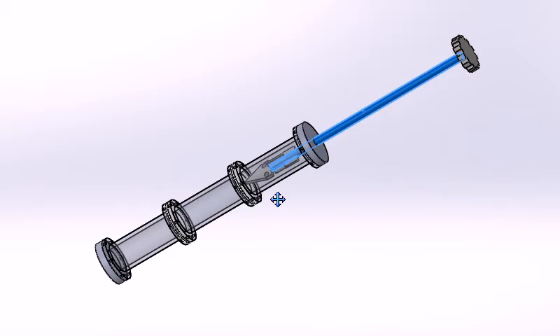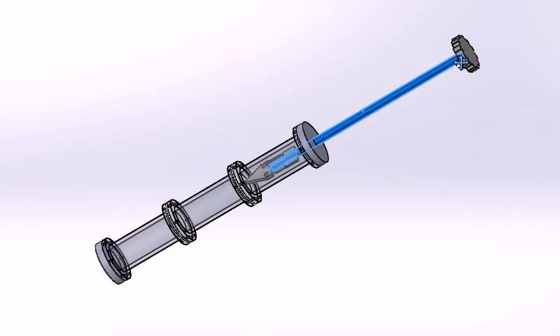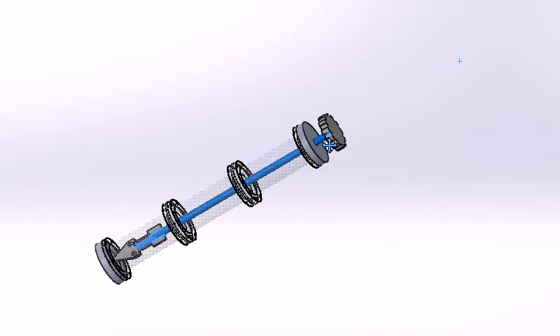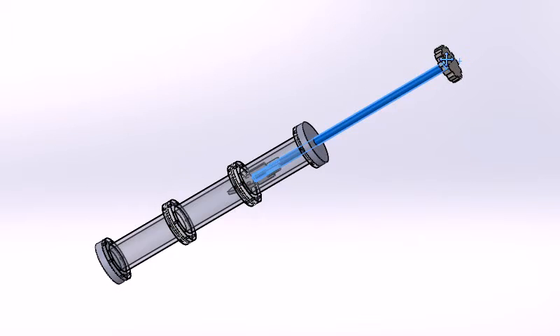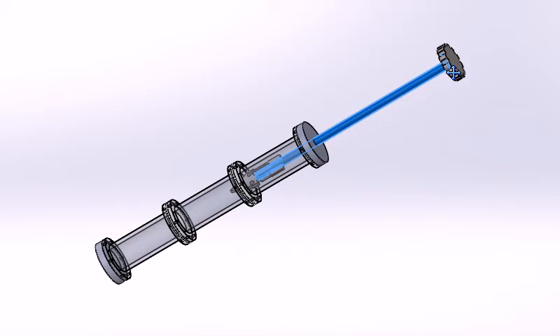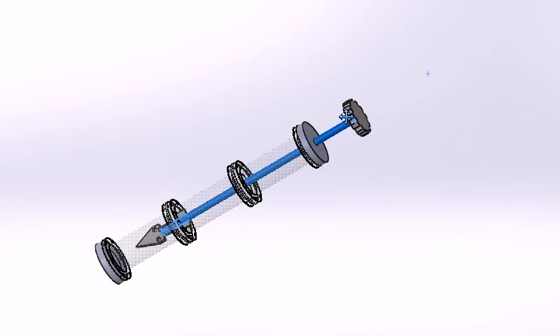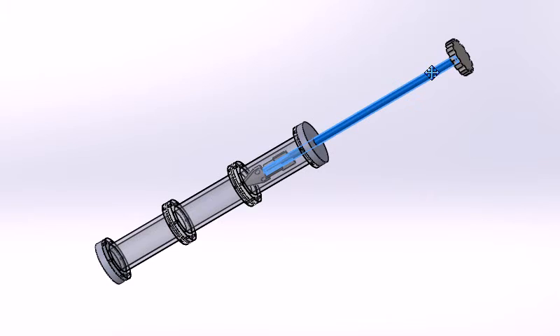In addition, we wouldn't really move the plunger into the specimen container. The plunger and the motor that rotates would be attached to the outer specimen container, and then the motor doing the rotating would also be attached to a screw drive that moved the actual entire assembly up into the plunger. This is kind of like a relative motion. It would really be that this part is fixed and the container itself moves up.